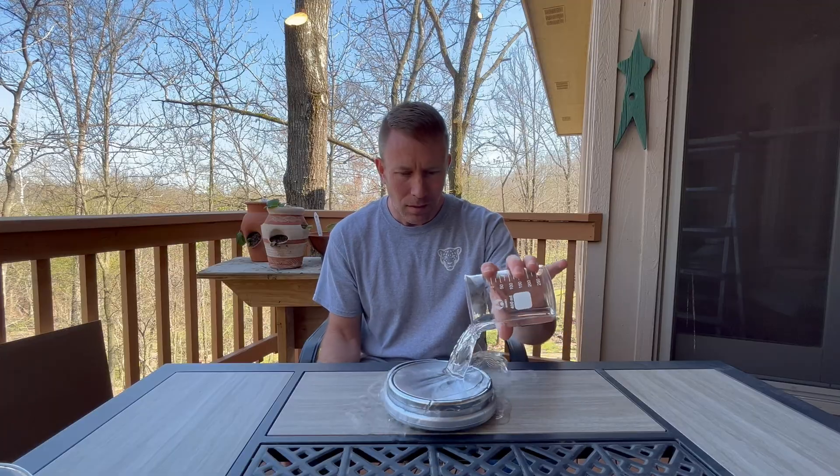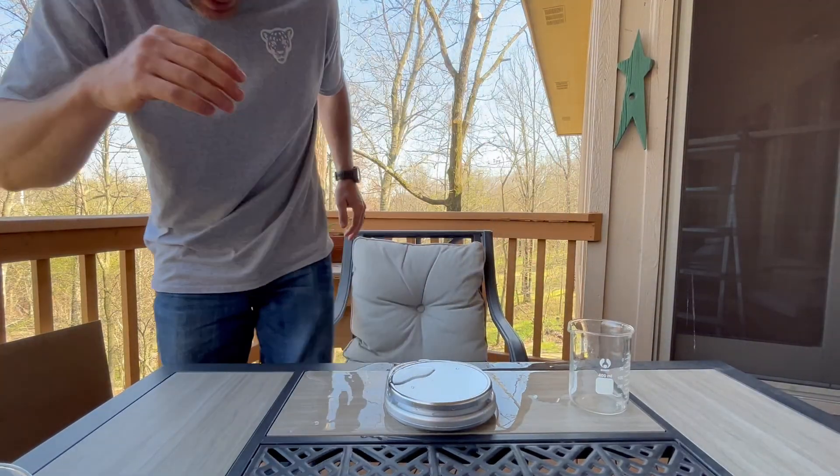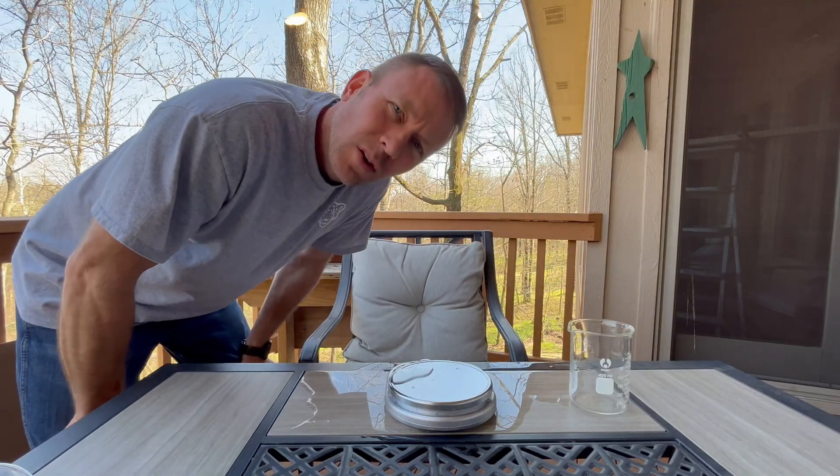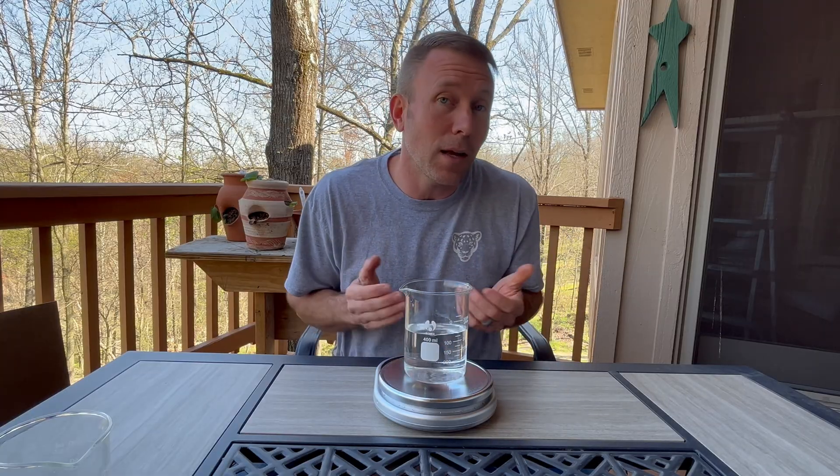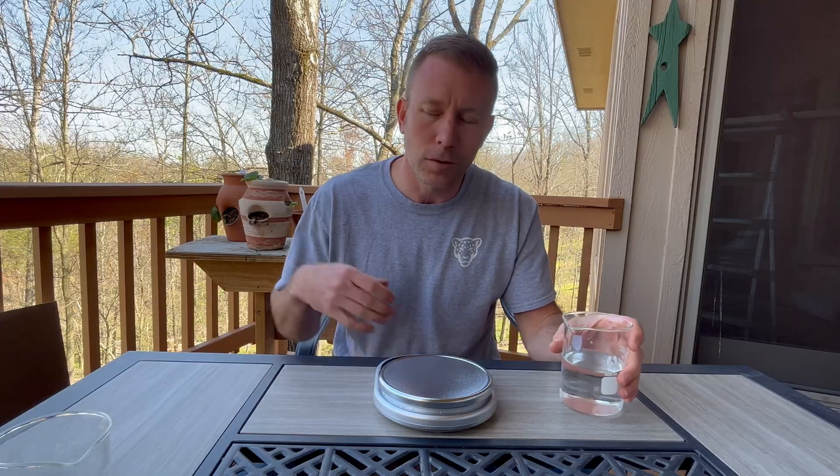Now what do you do if you need to find the mass or the weight of a liquid? You're going to have to use a container, but that creates a small problem — you're not just finding the mass of the liquid, but the liquid plus the container. The easy workaround: first, put an empty container on the scale and find its mass or weight, and write that number down. Then add the liquid, find the total mass or weight, and subtract out the weight of the empty container.